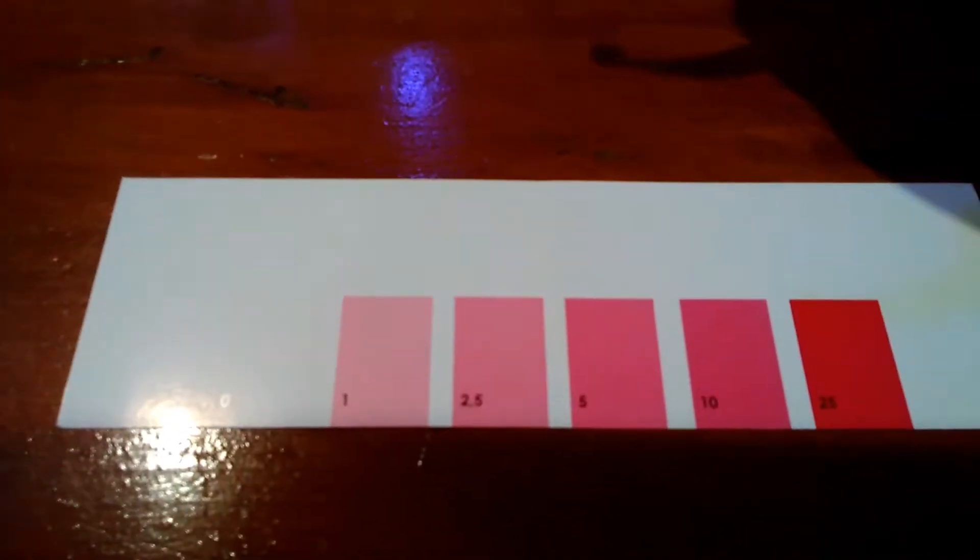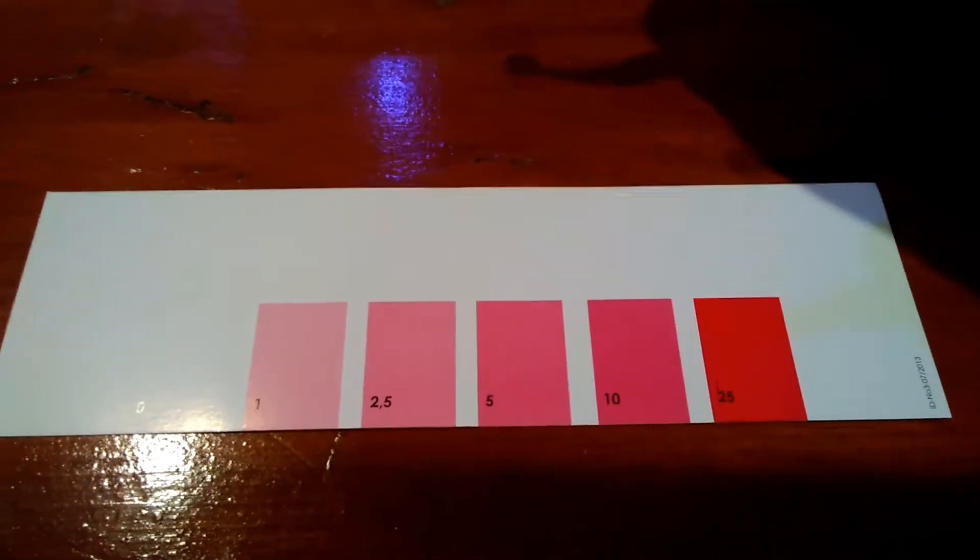So here's the color code chart: 0, 1, 2.5, 5, 10, and 25.